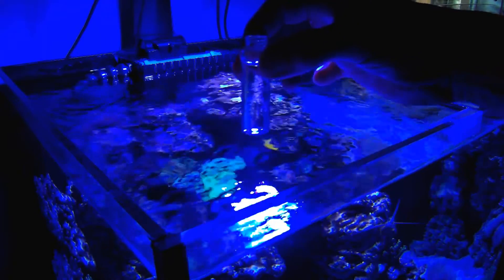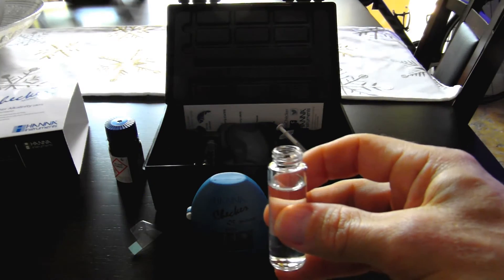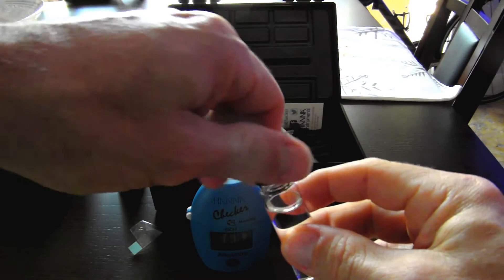Always a challenge to get just the right amount. Okay, looks like we're good there. All right, with a 10 milliliter sample of aquarium water, I'm going to replace the cap.